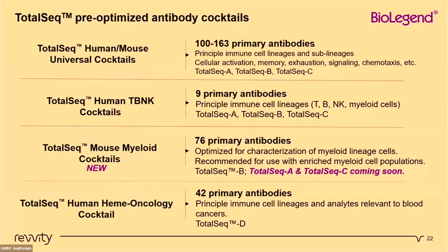As I mentioned, we have the mouse myeloid cocktail in total-seq B format. A and C are coming soon. And this is optimized for characterization of myeloid lineage cells, and it's recommended for use with enriched myeloid populations. So we actually tested it on spleens and bone marrow that had been depleted of T and B cells before looking at this. Because if you think about it, when you're capturing 10 or 20,000 cells from a sample that are mainly T cells, and you haven't depleted the T and Bs out of there, then you're losing a lot of information. You're cutting down to a very small number of cells looking at those myeloid lineage cells. So it's nice to do that depletion first, then you really get into characterizing what you have in terms of that myeloid population.